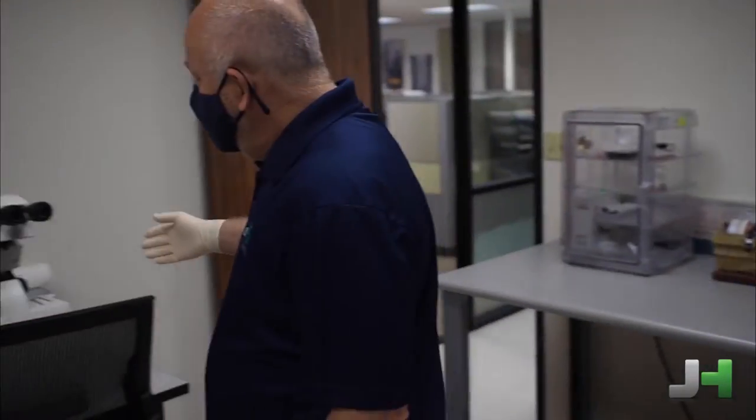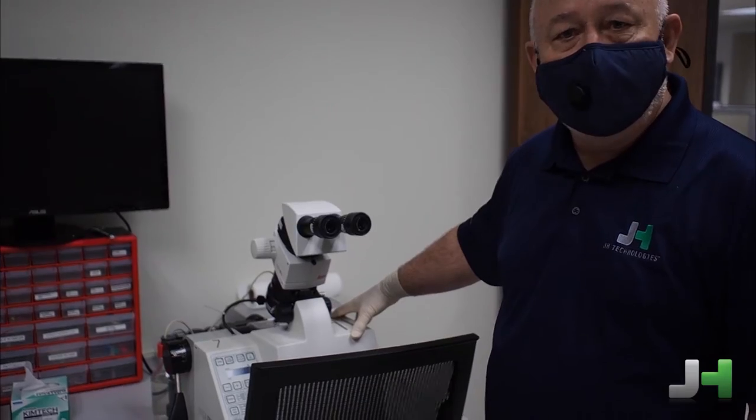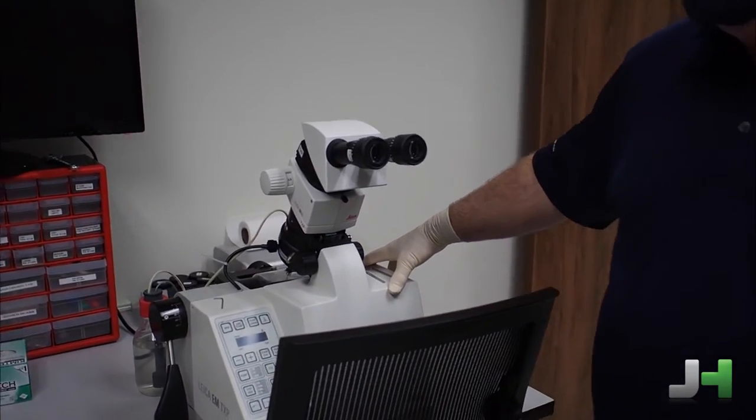So inside of this lab, we have a coder, an A600 coder. And then over here, we have a TXP. The TXP is a grinding and polishing tool, micro grinding, micro polishing. So it takes off larger amounts of material.